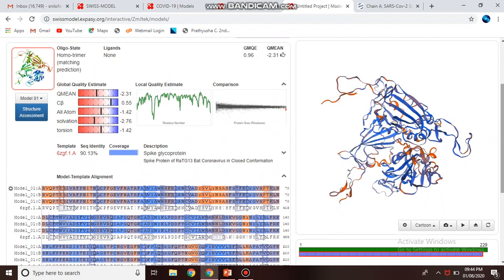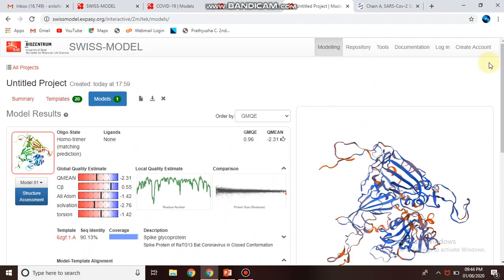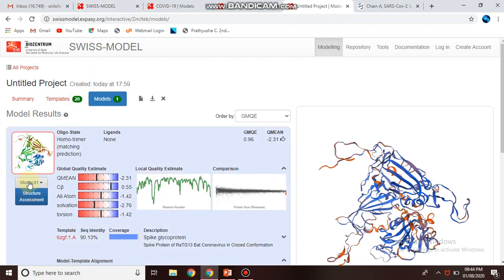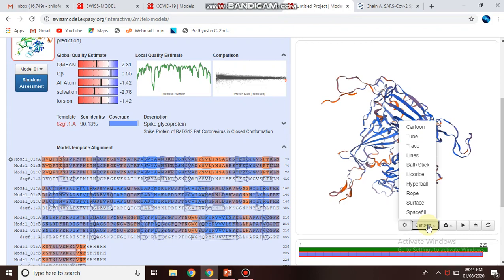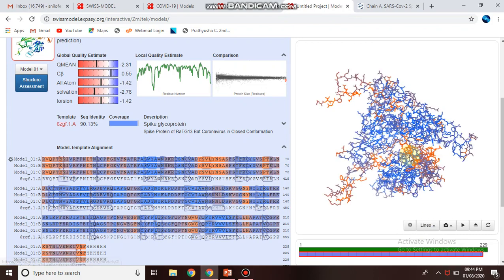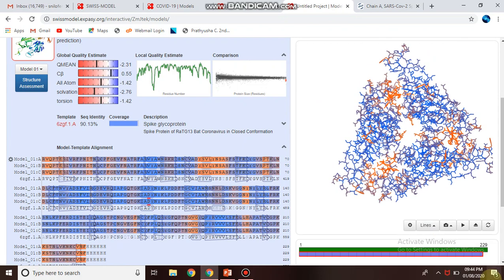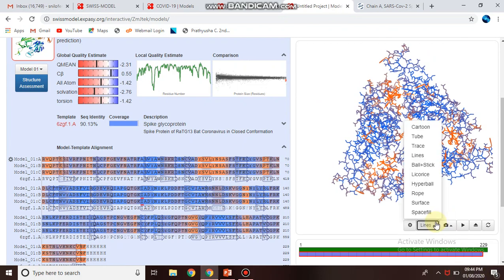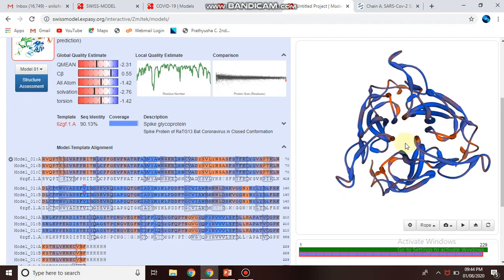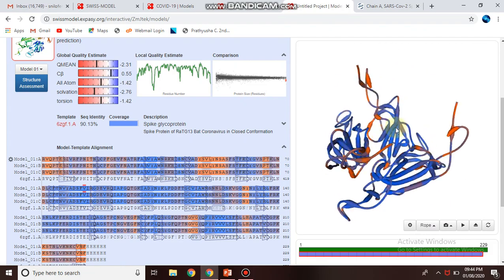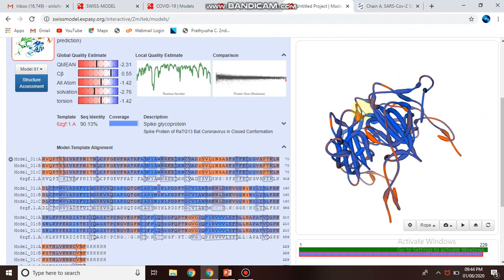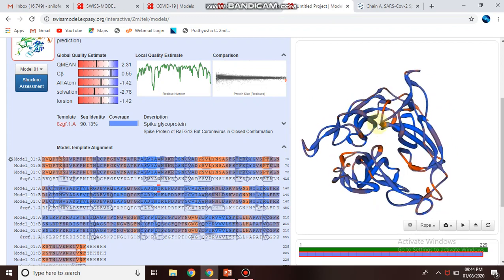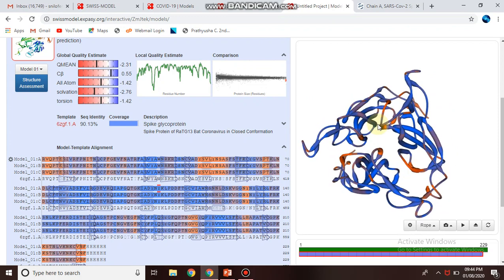Here you can see this model and you can use this 3D structure for your molecular docking study. You can change the structure representation to different formats and see how your structure 3D representation looks.